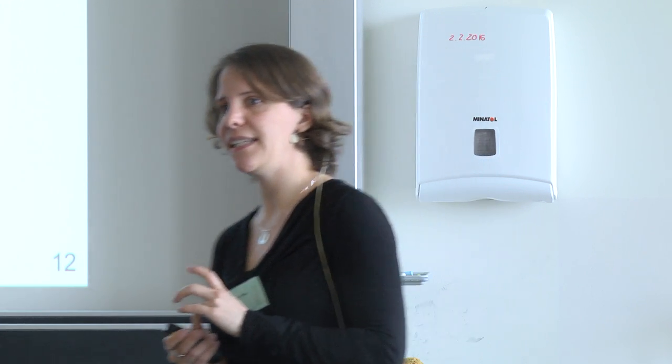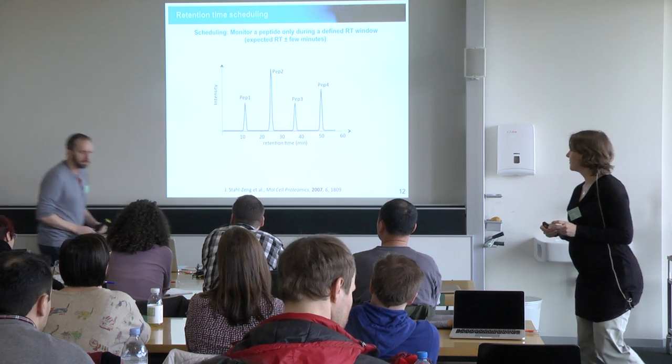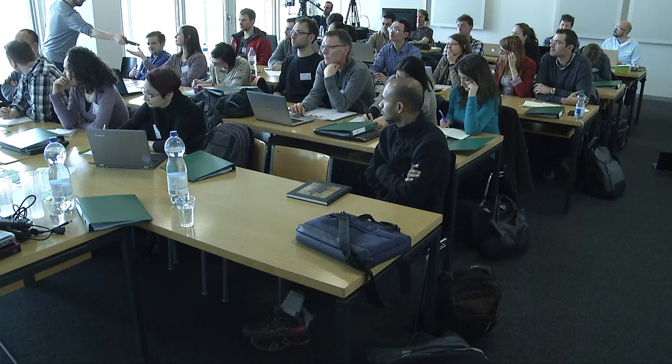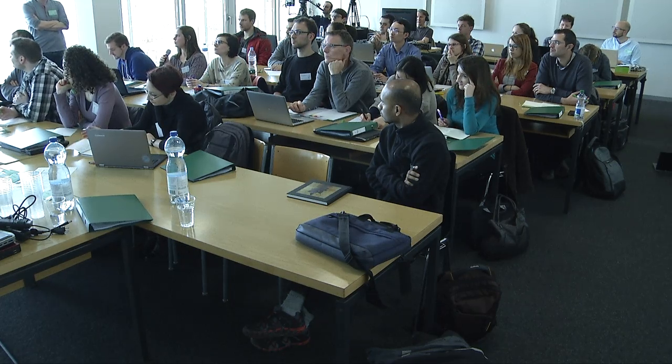Can somebody explain it? Maybe with a microphone. Sorry. Who was it? Yeah. Scheduled means you are doing MRM in a retention time window.